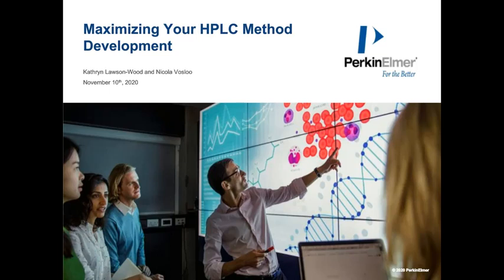During this webinar, we will investigate what selectivity is, how it's influenced, and why it's one of the most effective factors to change for enhancing resolution. We will provide an overview of various reverse phase HPLC phase chemistries available on the market and discuss the importance of a column toolkit for delivering orthogonal selectivity, with examples of screening various phase chemistries.